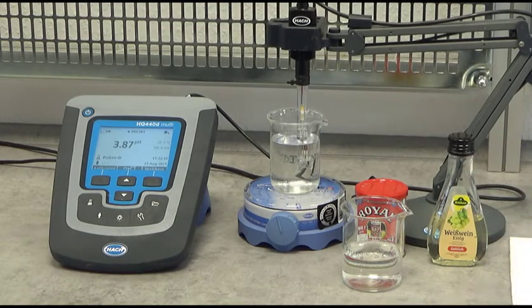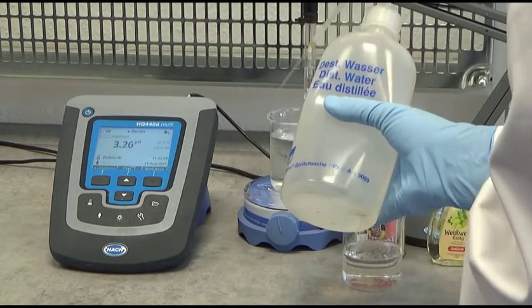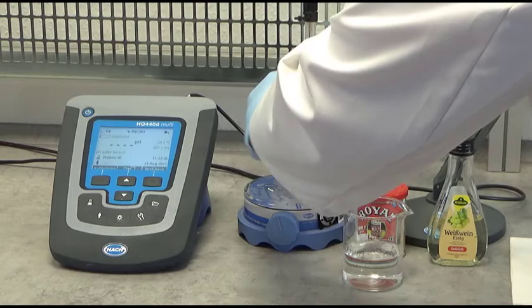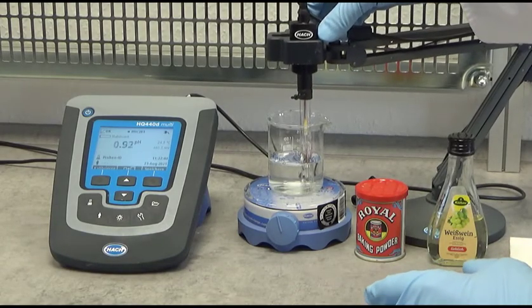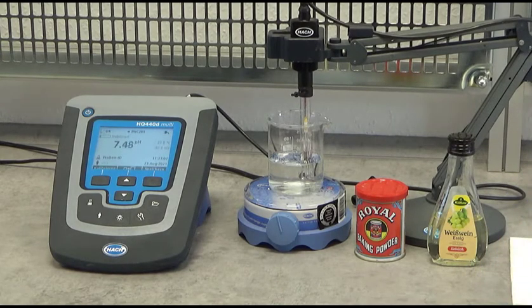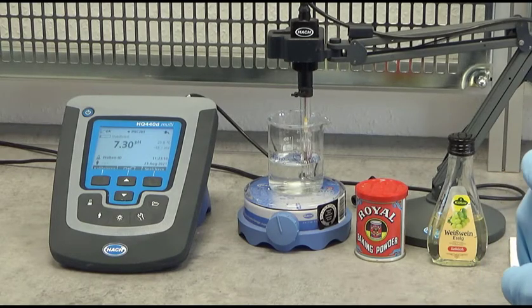Now I will rinse the pH electrode and dry it a little bit with a soft cloth, then place the pH meter into the other sample. That is the deionized water with sodium bicarbonate. We let it stabilize for a few seconds.